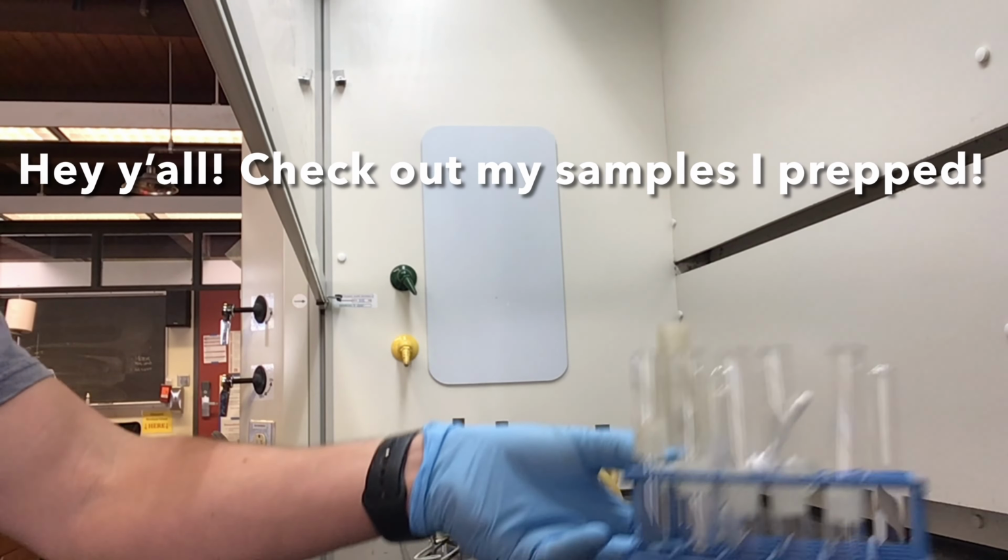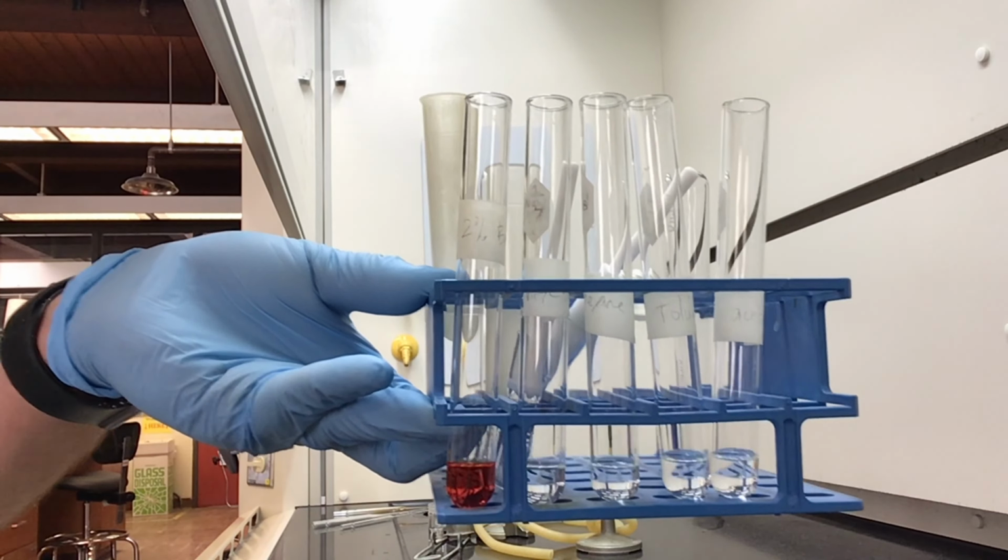Yeah, that's it, right? Super easy. Let's see what happens, and then you get to see what it looks like. I would say if you're ever unsure, just test it again. Because what's 4 drops of your unknown? What's 50 milligrams of your unknown? Not a big deal, but to be positive or sure about what you actually have in your test tube, that's priceless. You know what I'm saying? You know, that MasterCard thing.